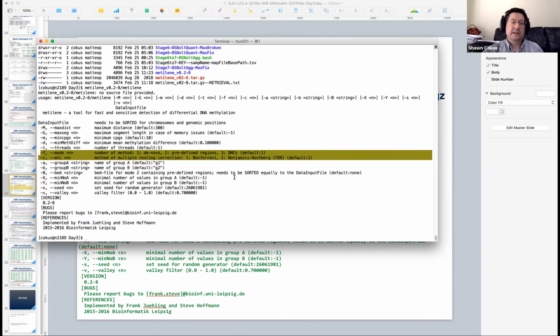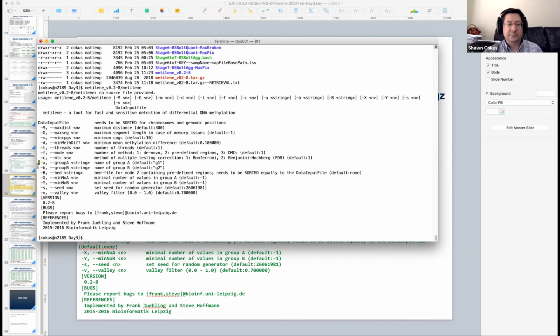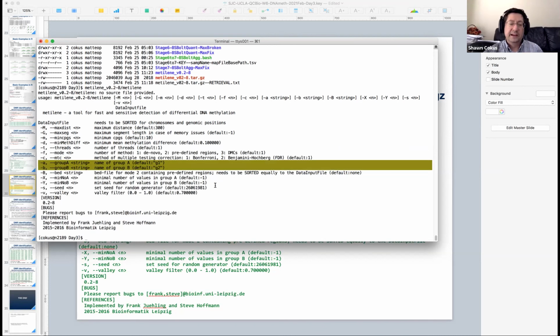And then we have to tell it which samples are in group A and which samples are in group B. The way it does that is in a way not flexible, in a way nice, and it's a way that we've set up to work very well with the way we have things right now. The input is going to be one of these aggregated matrices. We made this aggregate matrix thing we ran from BSBolt to get our data. It's the data we imported into R, right?